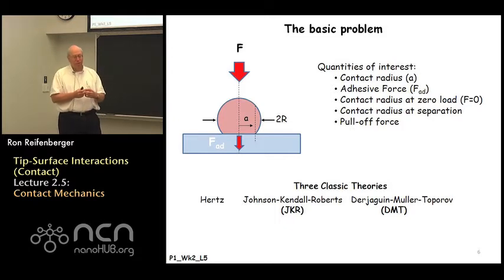We'd also like to be able to predict the pull-off force. In other words, after we make contact, after we load the tip into the substrate, how much force is required to actually lift off or pull off the tip again. And then lastly, is there a contact radius and separation that we can predict?